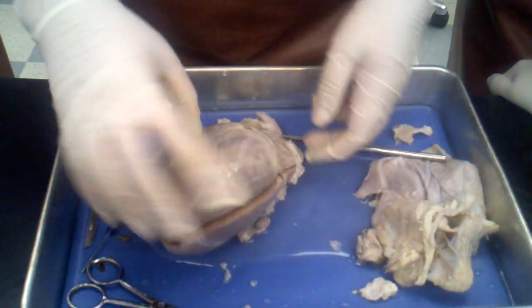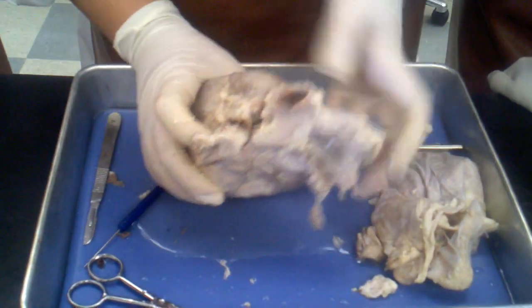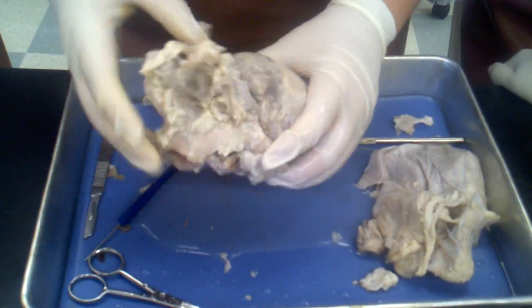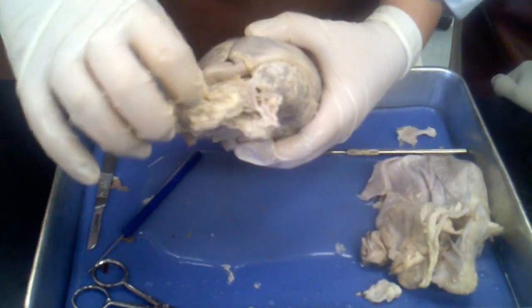And it would go out through the aorta. And here's your aorta right here — it's nice and thick. And then when everything comes back in, it's going to come back in through here.